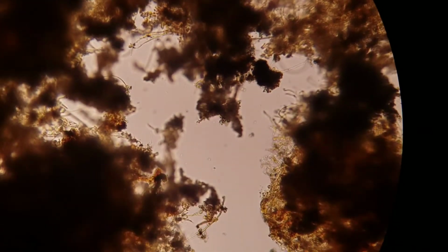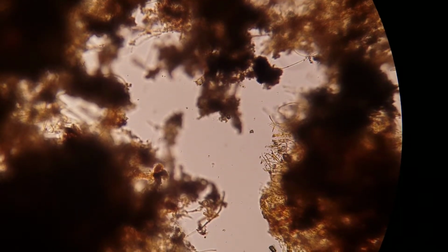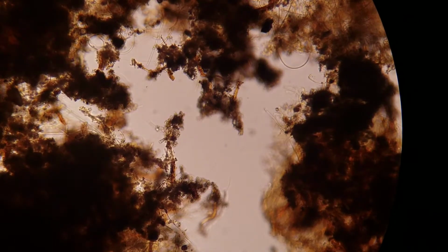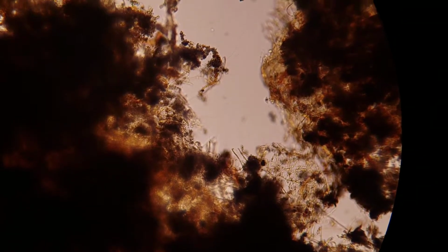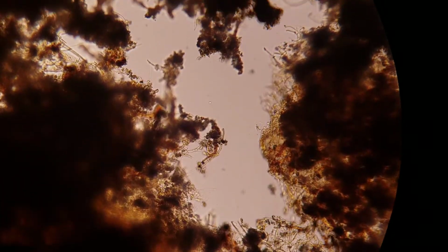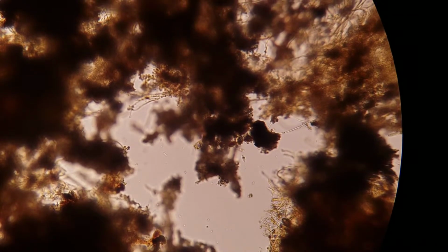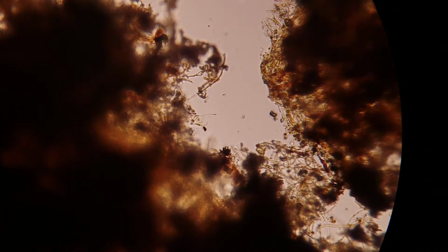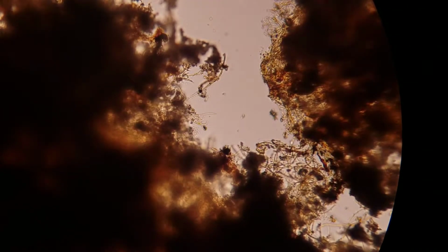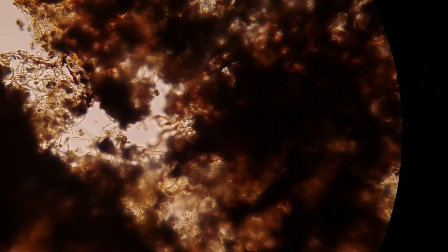Well, I do see some movement. Coming down this little valley. Oh, there's something swimming. It's a very tiny thing, whatever that is. Some kind of little flagellate, I would imagine. Diatoms and little things at the bottom moving around. Just keep sneaking around. What's in here?